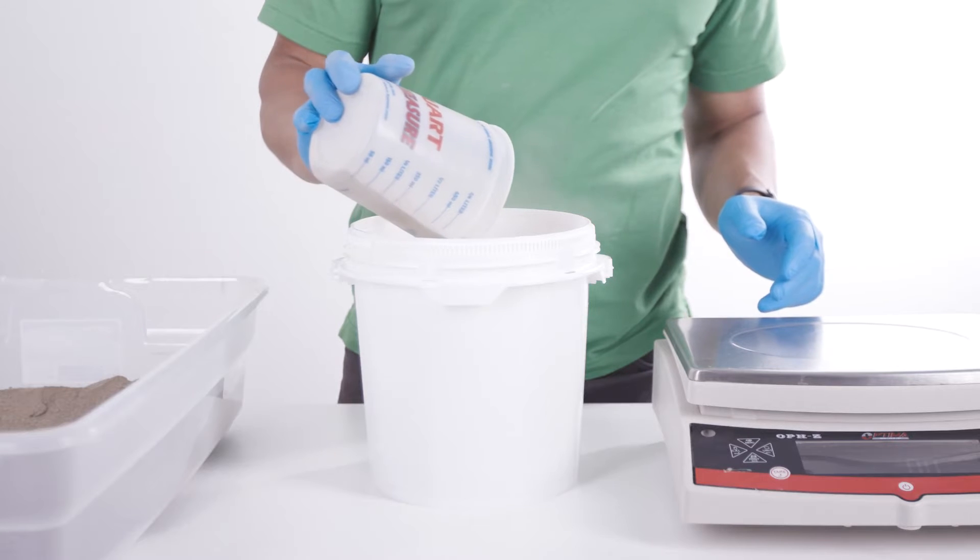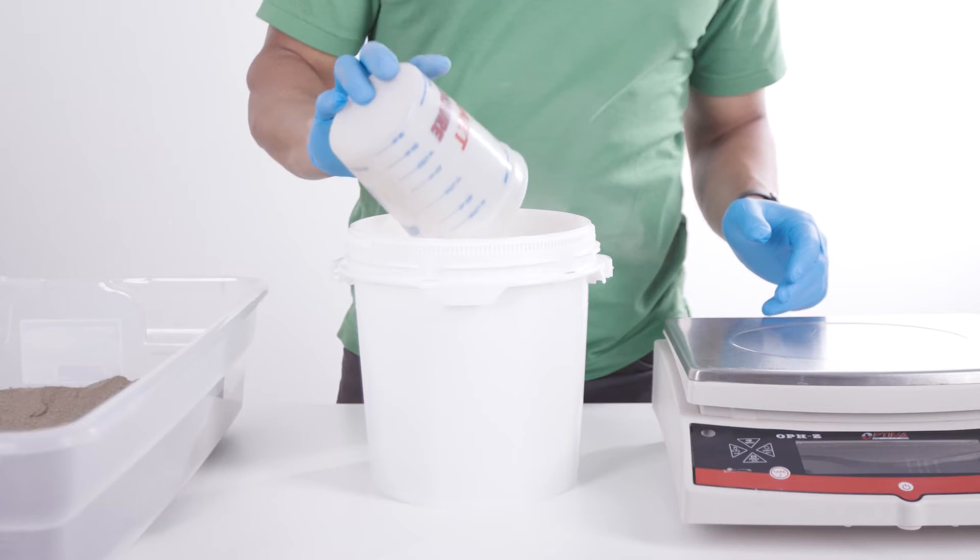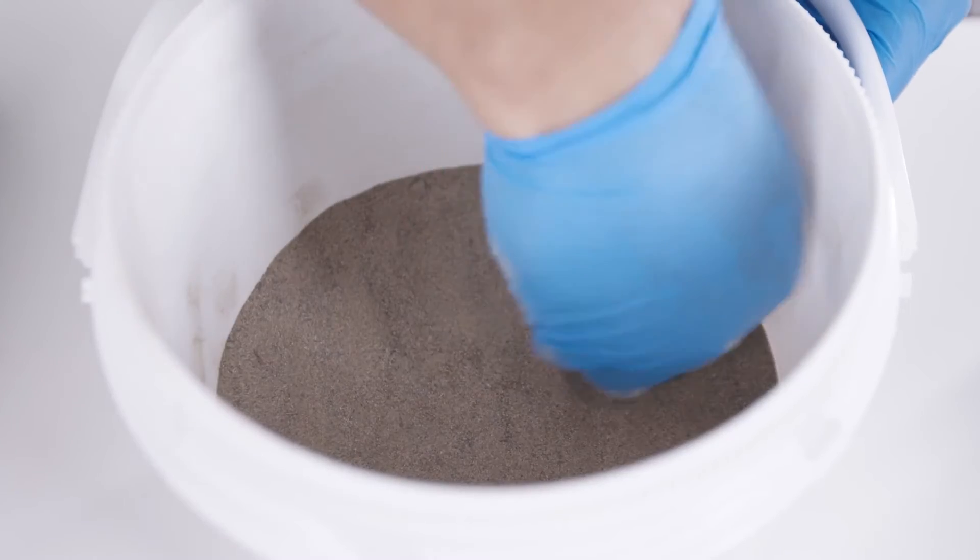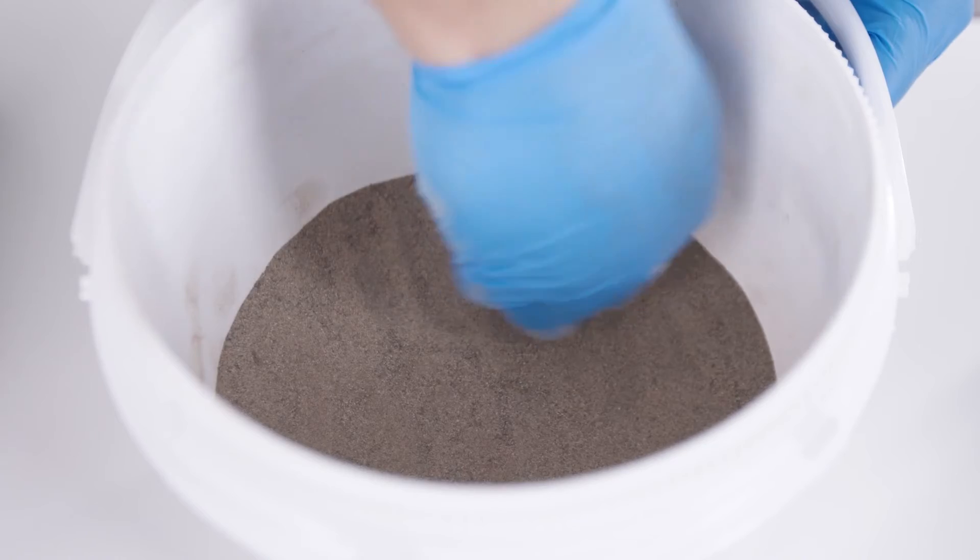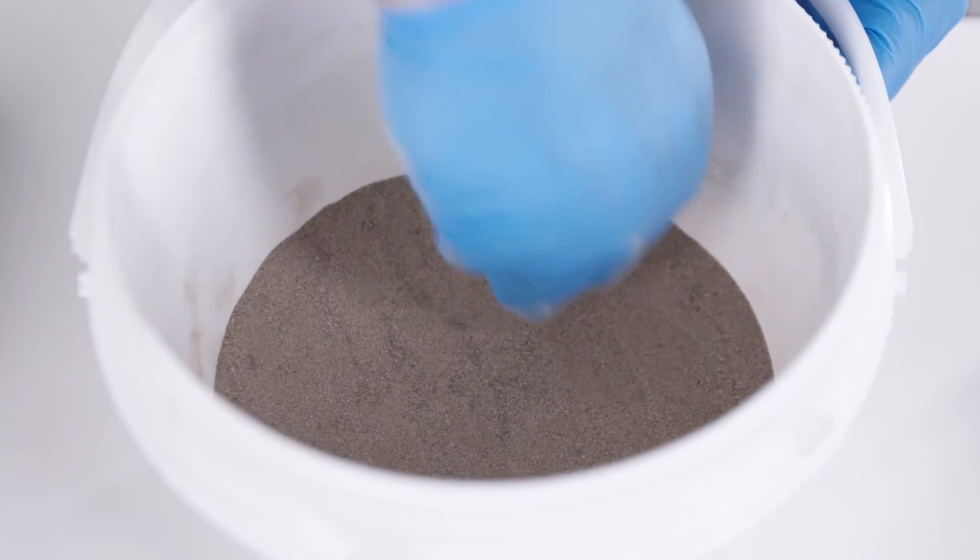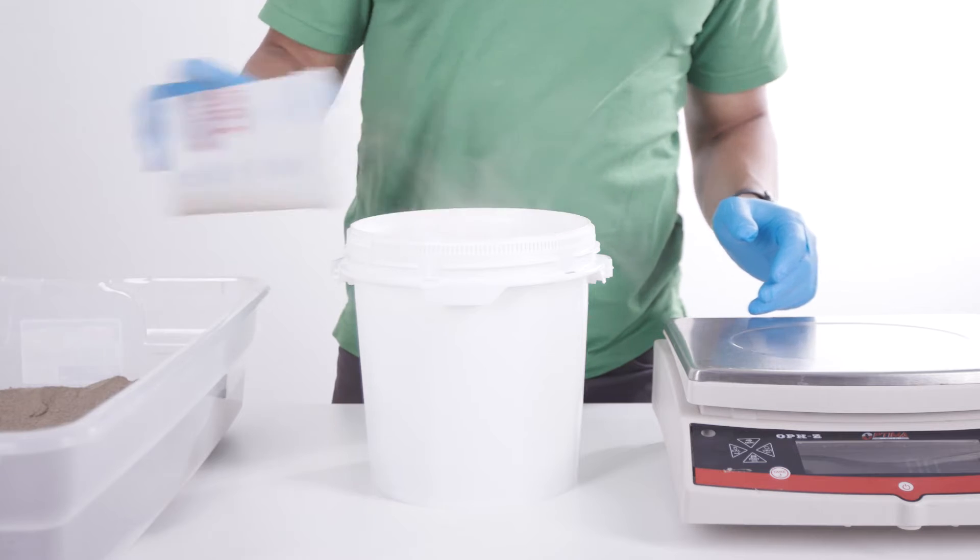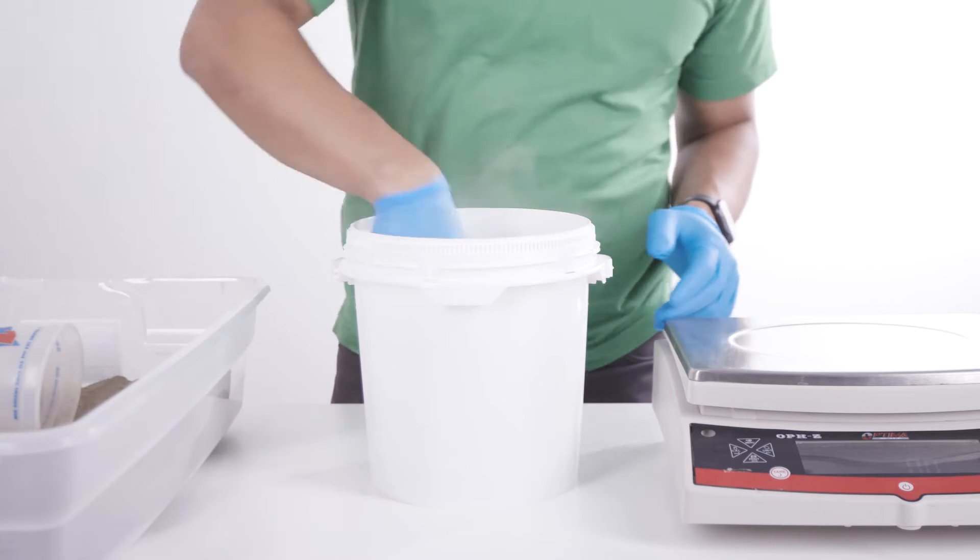To start the calibration, pack the soil into the calibration container at approximately the field bulk density. If you start with dry soil, control the bulk density by packing a known mass of soil into a known container volume. It's generally necessary to add the soil in layers, packing each layer before adding the next.